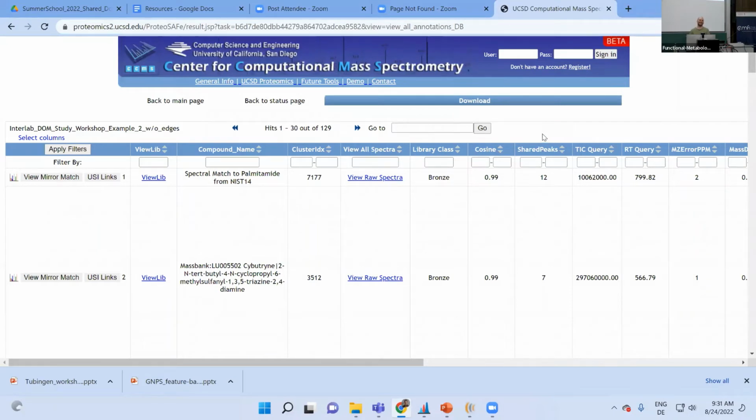Interesting. Where did you get your sample from again? Well, the question is who sampled those samples? All right, I want to hear a couple. Come on, tell me. So there's this image here, is that a herbicide? Okay.